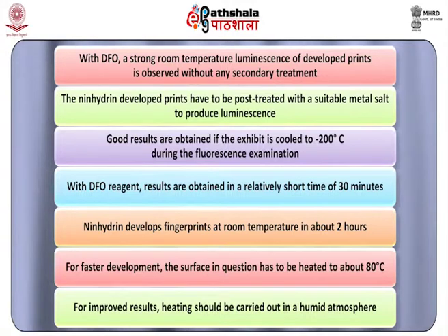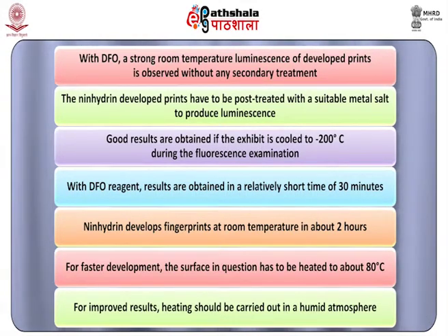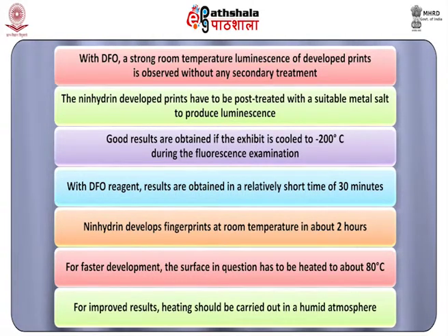Number 1. With DFO, a strong room temperature luminescence of developed prints is observed without any secondary treatment. Against this, the Ninhydrin developed prints have to be post treated with a suitable metal salt to produce luminescence. Good results are obtained if the exhibit is cooled to minus 200 degrees Celsius during the fluorescence examination.